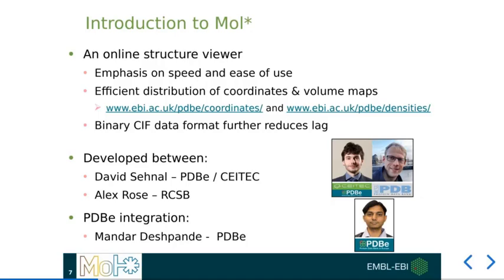Therefore, it was with the idea of resolving these 2 conflicts that Mol* was developed, to provide a molecular viewer that was easy to use and suitable for embedding in online content, but which could also be used to explore aspects which are typically more computationally demanding. This last challenge was tackled from a few directions, and now, as I'll show later, we also host specific data servers which can be used to serve both coordinate and volume data in a very precise manner, so as to be as efficient with data transfer, data passing, and data processing as possible.